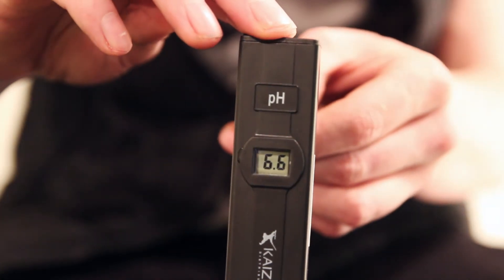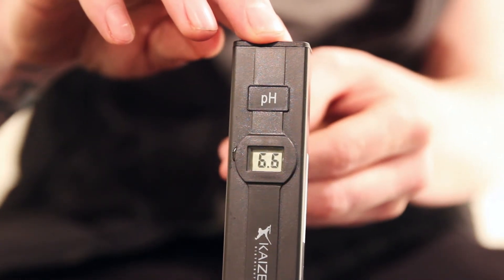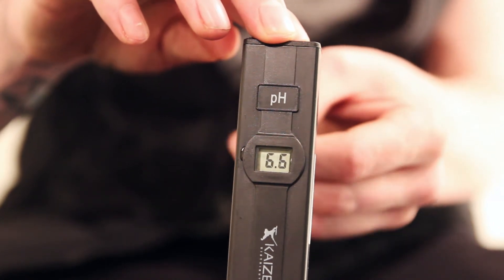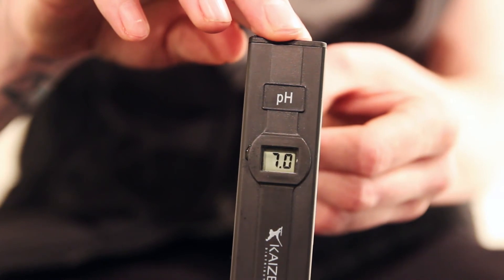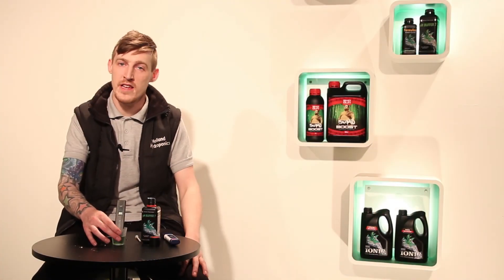With the screwdriver, pop it into the little slit at the back. Once in, it will be clockwise to raise the number and anti-clockwise to reduce the number. So in this case, we want to go clockwise to increase. Turn clockwise all the way up until your pen reaches 7.0. Then you take the screwdriver out, pop it down, and your pH pen is calibrated.